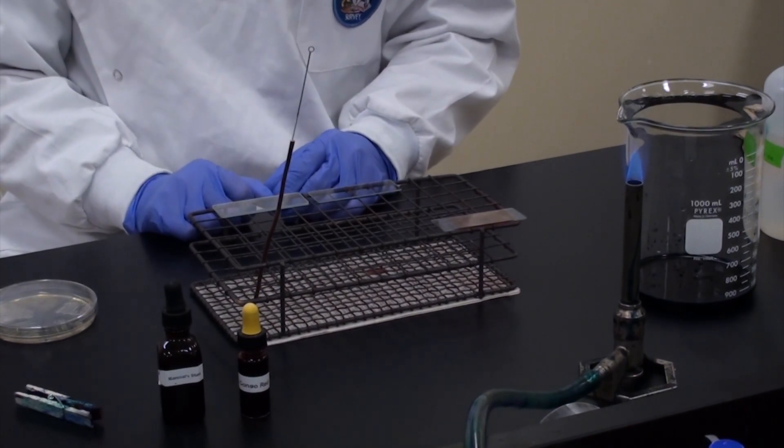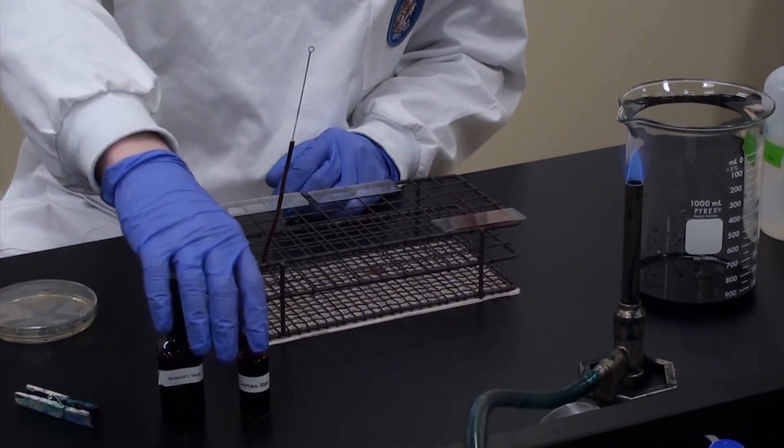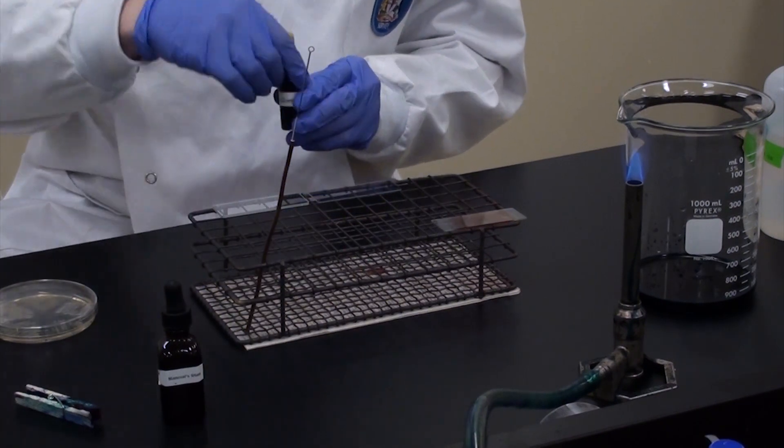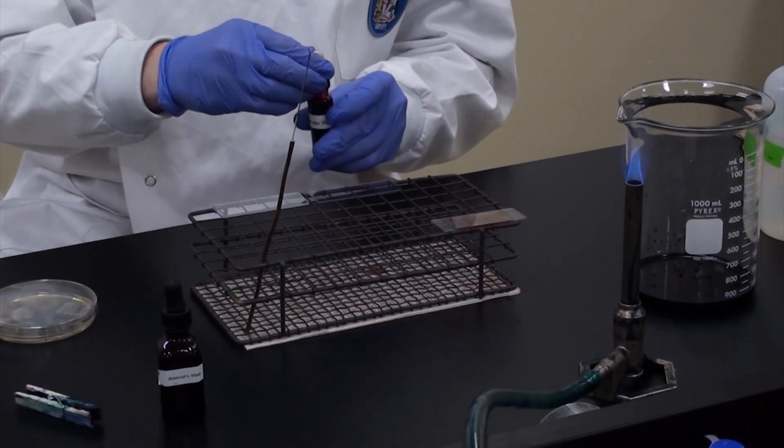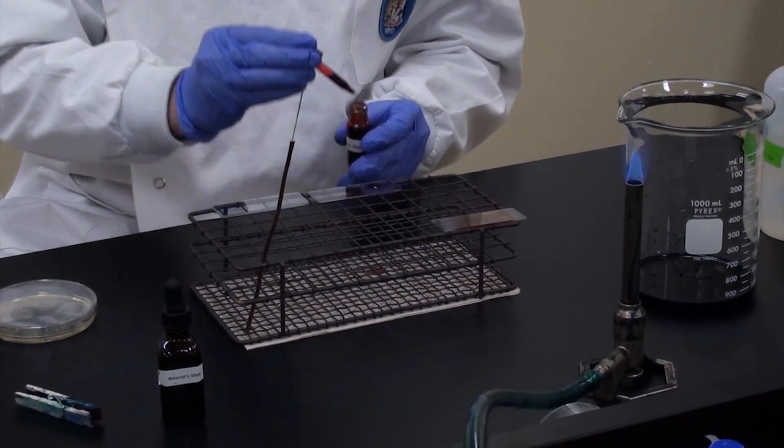Okay, so we're going to start it just like we did with the negative stain. First we're going to take our Congo red and apply a swift and small drop to our slide. As such. Awesome.